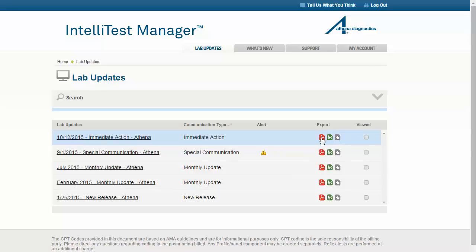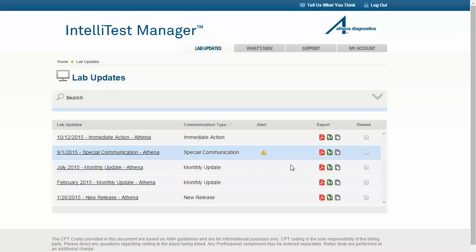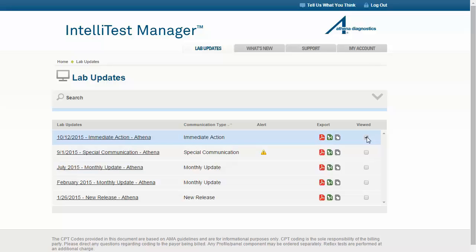Your options are to view the communication as a PDF or Excel file, or click on the last icon to select your vendor-specific product and export an Excel file that is in the format specified by your EMR or LIS vendor. This may facilitate the loading of test updates into your system. The last column allows you to select a checkbox indicating that you have viewed the communication, which can be used to assist you with managing your actions for each communication. If you have checked the box that you have viewed the communication, the box will automatically be unchecked if a revision to the communication is published. This is done in an effort to assist you in quickly identifying what you should review when you log in.